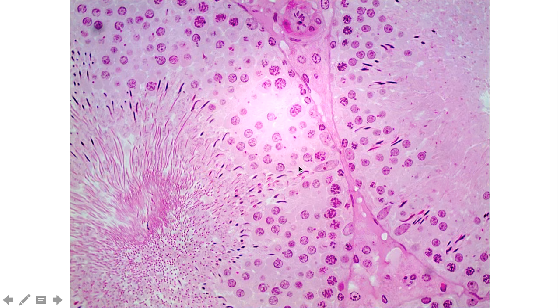The other cells that make up these seminiferous tubules are the sustentacular cells. And these are the cells that I mentioned in lecture are actually quite large, with very, very large prominent nuclei with nucleoli inside them. So here we can see this is a nucleus. And then down here we can see a couple other nuclei of the much larger sustentacular cells.